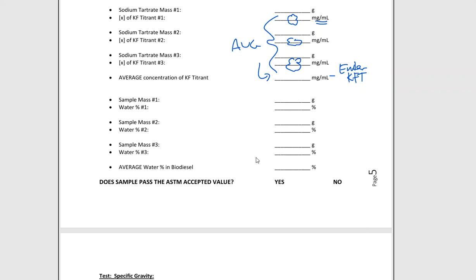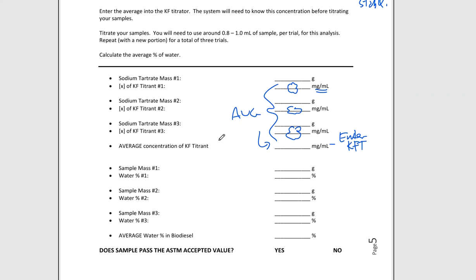So again, if you need steps on how to do that the proper way, you come and get me or come and get someone else, and we will walk you through those steps. It is not a big deal. It's not an issue. I do it all the time, so don't feel bad if you need some help with that. All right. Next up, we need to now titrate the samples.